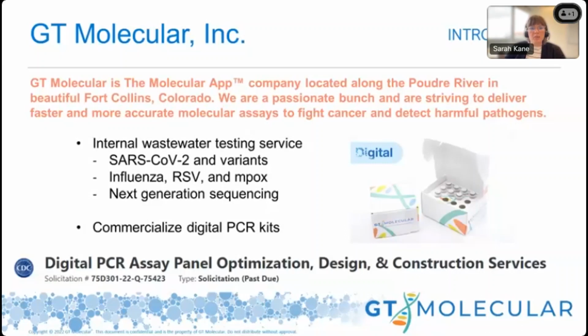Also, the lab has a passion for minimal residual disease monitoring and cancer, and that's actually how we started out with our expertise in digital PCR. Then we adopted the ability to apply digital PCR assay development to wastewater surveillance, which ultimately culminated in the contract that we received from the CDC to develop their assays for digital PCR platforms. At the end of the talk, I'll prioritize discussing the next phase and why we need higher order multiplexing.